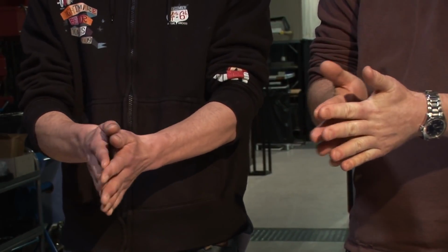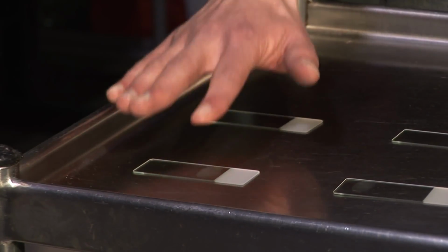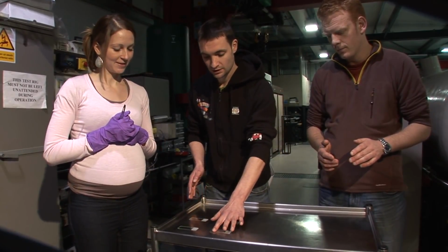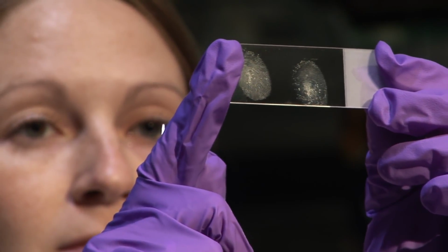Wonderful. So that just means that we've got all the sweats from the face incorporated with the sweats from their hands as well, which is representative of what somebody would actually have in their sweats if they were going to commit a crime. And something that's really interesting that I'm investigating at the moment is whether we can tell whether somebody's a smoker or a drug user from the chemical composition of their fingerprints.